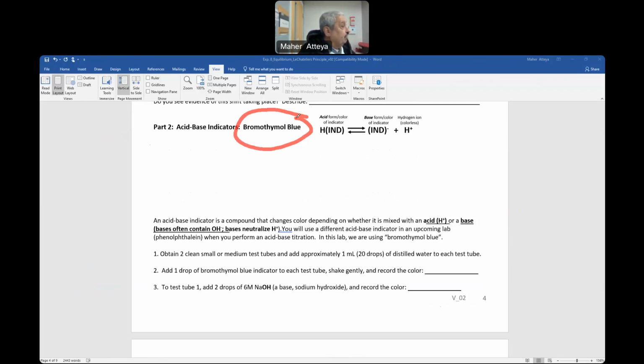This is the same thing as when you dye your hair. The organic dyes are really indicators, because I can take any dye, dye my hair a color, then put an acid like vinegar on it, or any base on it, and you'll see the color of this dye will change. So you can change your dye without buying any. Just take one color, and this color can switch according to whatever the medium is, acidic or basic. So this is the form of an acid, which is in bromothymol.